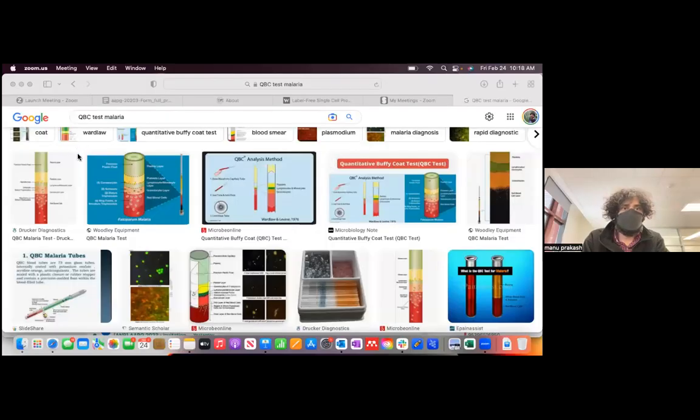Okay, so the thread that I want to show you guys is called the QBC test malaria. This is the challenge that we first started with.